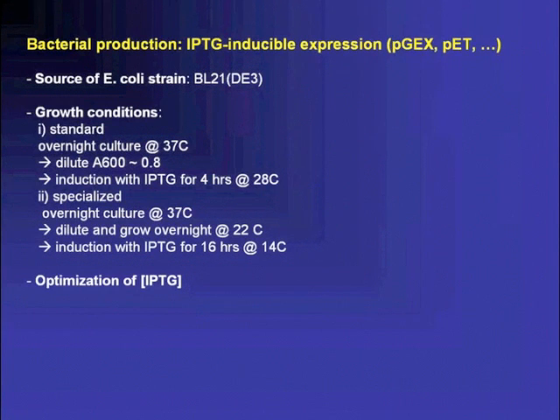Then I wanted to say something about growth conditions. Of course, most people are aware of the standard growing conditions in which you dilute and then have the same-day expression at a lower temperature with the IPTG. However, since we worked with difficult-to-express proteins, we needed to develop a new protocol.